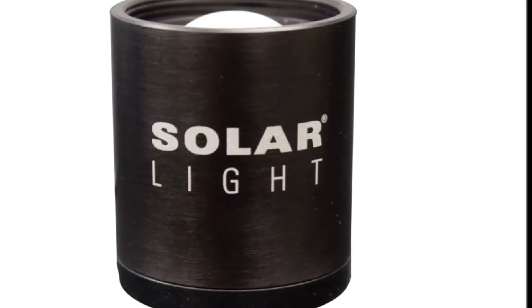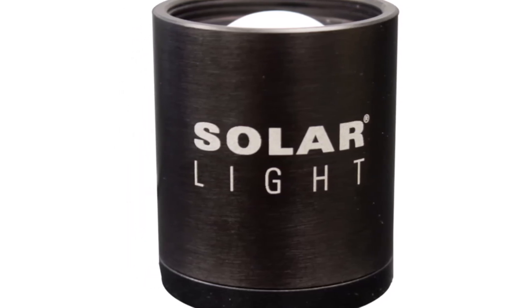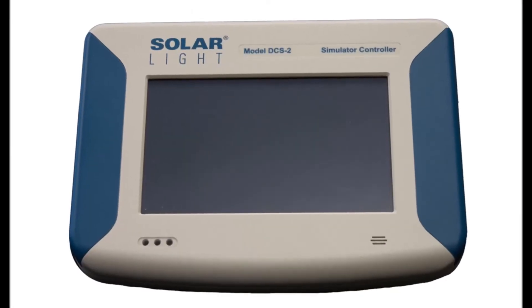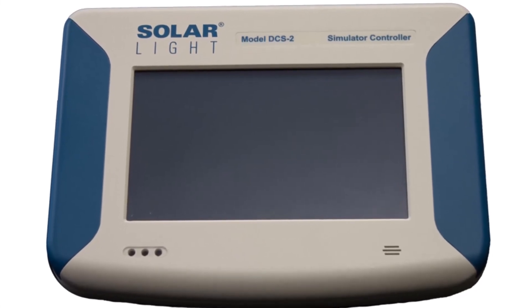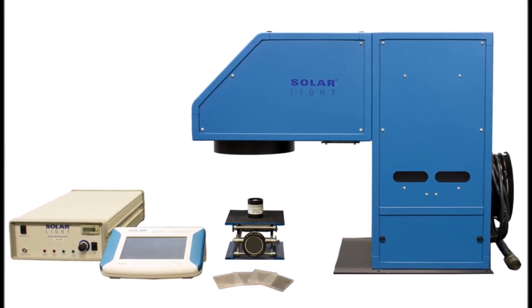Dose is measured using the included PMA-2101 series biologically weighted sensor, which follows the erythema action spectrum for effective radiation, as well as the DCS-2 automated dose control system, which ensures that the required dose is delivered to the PMMA plates.